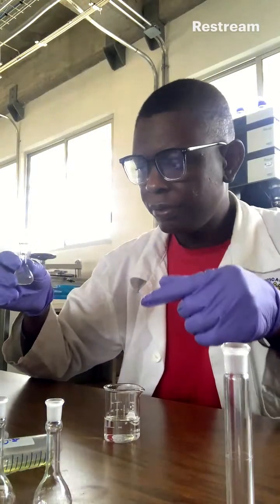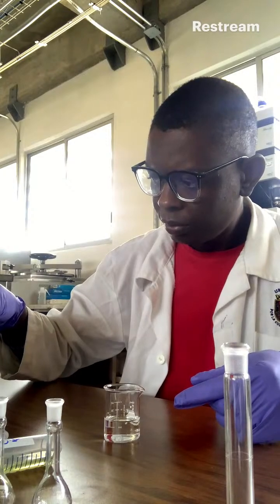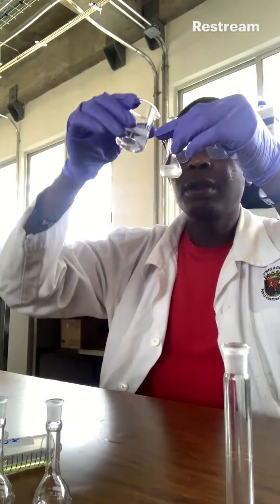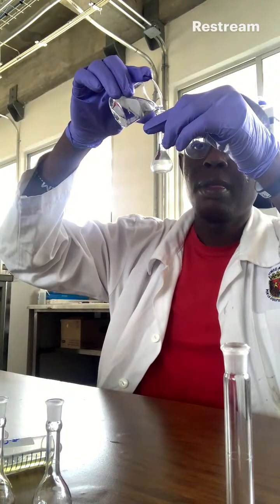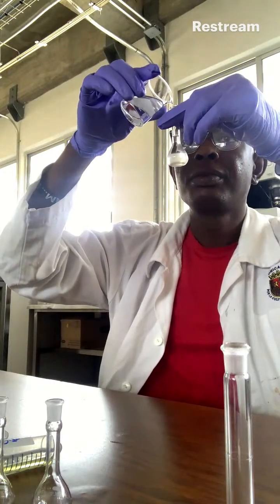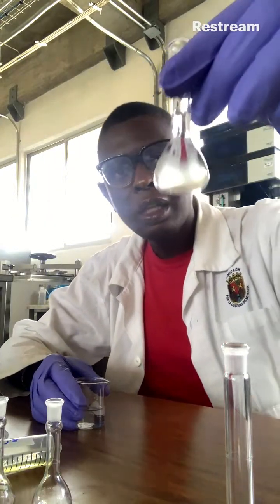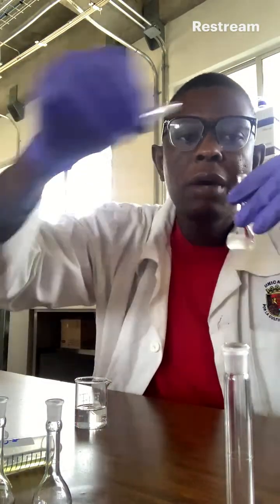I'm trying to dilute. All right, so I just diluted it to the meniscus line, and then I will shake.